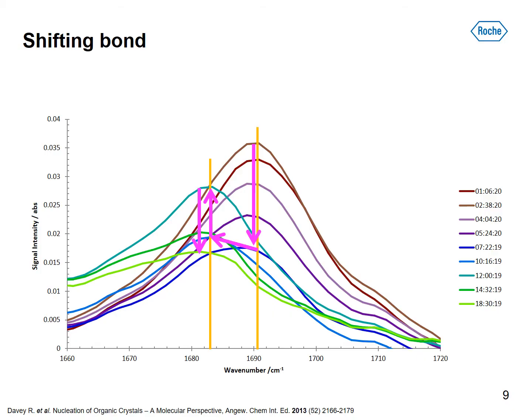In this theory, the API gets surrounded by the solvent before it forms a solvate crystal. The interaction between the solvent and the API could impact the carbonyl stretching vibration, which leads to the shift to a lower wave number range. But from the X-ray diffraction, we knew that the desired polymorphic form B was produced, which was no solvate.